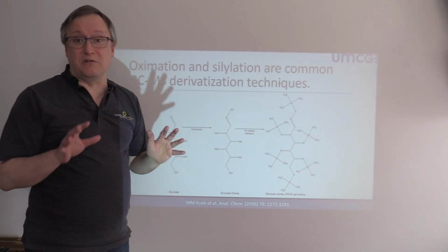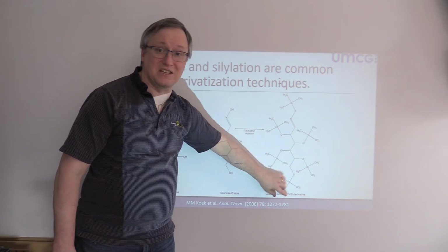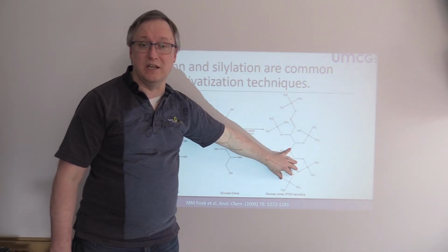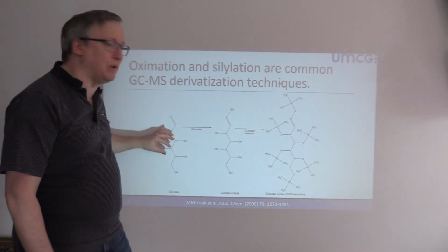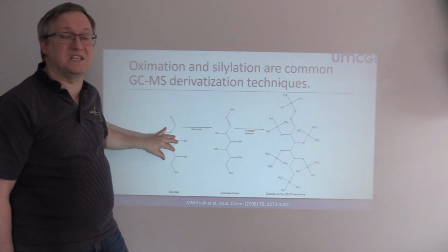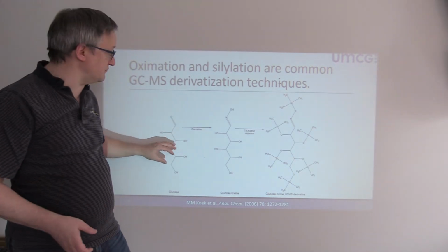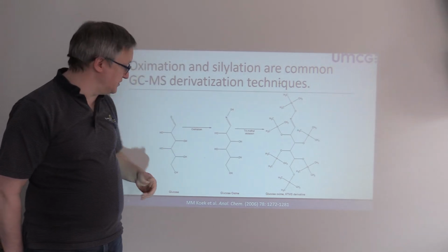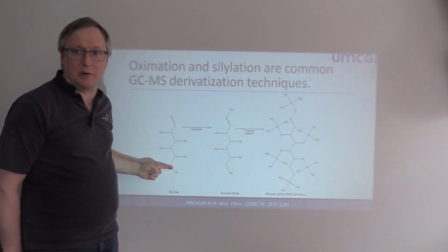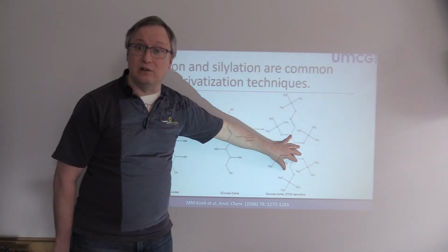So you might ask the reasonable question, if we measure glucose oxime 6-TMS as our metabolite in the mass spec, how much does that resemble the quantities of the metabolite that we started the derivatization process with? And in the case of 6-carbon sugars, how many different 6-carbon sugars go through this process and look identical afterwards?